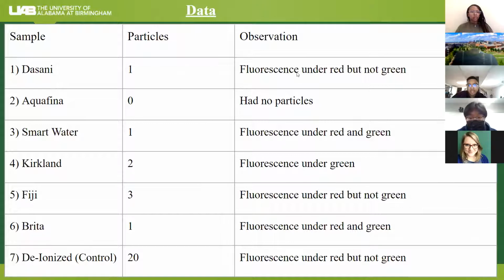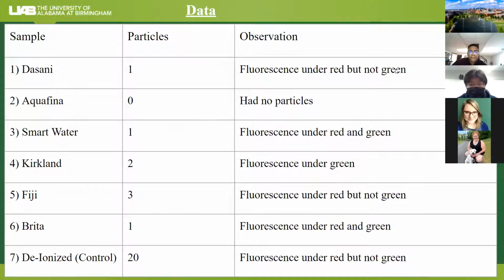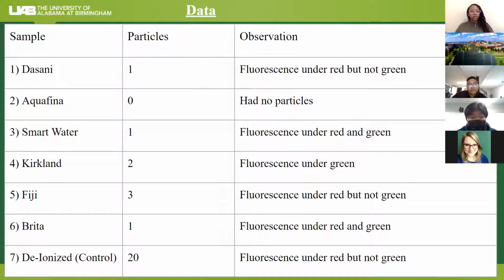But the Dasani fluoresced under red, but not green, so that was maybe just an organic particle that fluoresced on its own.